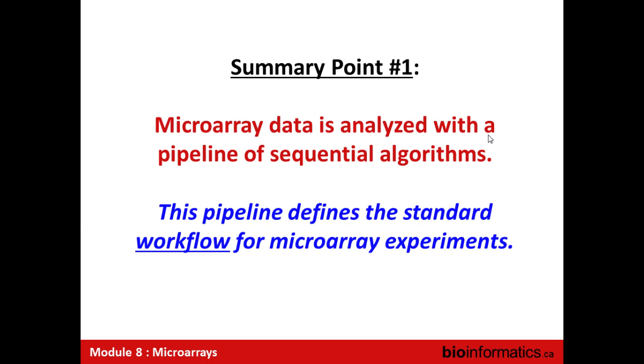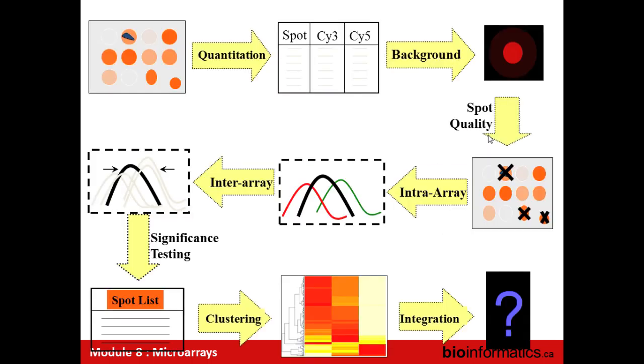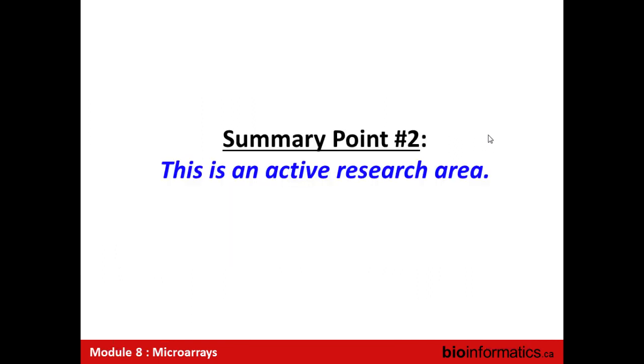Remember the following things. Microarray data is summarized with a pipeline of algorithms, and that's your standard workflow. Remember that pipeline is critical, because then you look at an experiment and go, which steps are out of the pipeline. That's the pipeline. Sometimes with some technologies, there will be steps that split, but these key characteristics are present in just about every microarray.